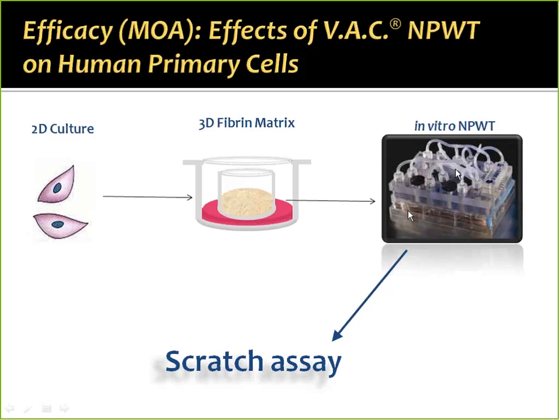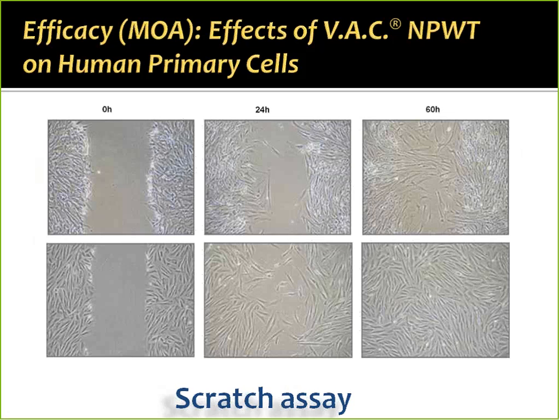We then, previous to having the xCELLigence, would test the cells for effects on other cells that have been laid down on a monolayer through a scratch assay or things like that. But I think, as most of you probably are already familiar, the scratch assay is extremely time-consuming, and it's not always reproducible. I'm showing you here just one example of what it looks like. In this assay, we first culture a monolayer of cells, then using the pipette tip, we create a defect in the monolayer of about 1 millimeter thick, and then we monitor cell migration over time.